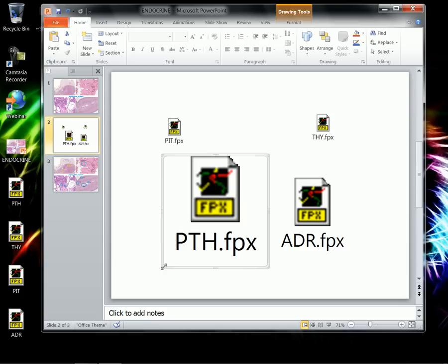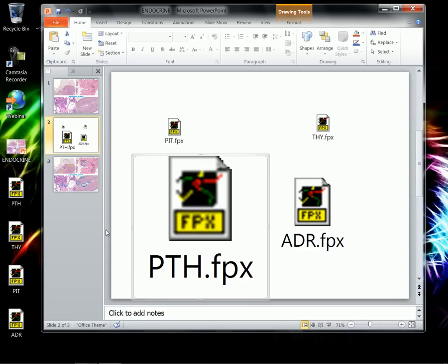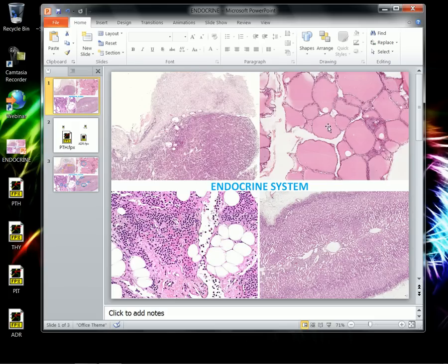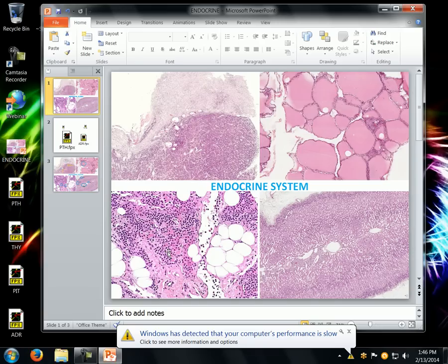So in your first PowerPoint, you have actually captured static images of pituitary and the thyroid and the parathyroid and the adrenal. But what you can do now is actually take those slides that you've created and click on them.